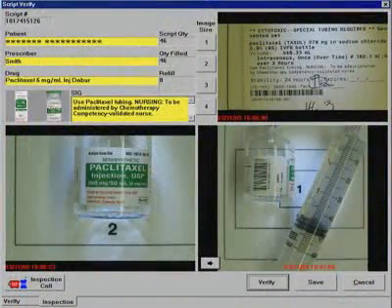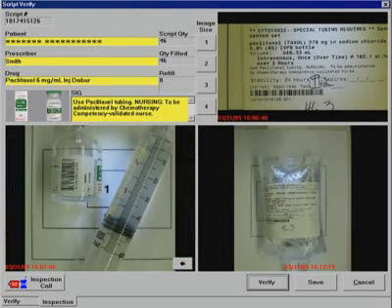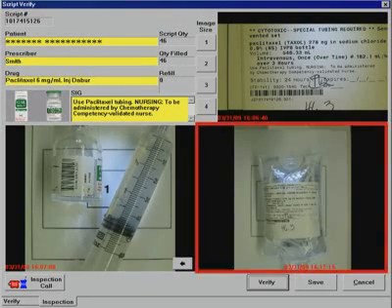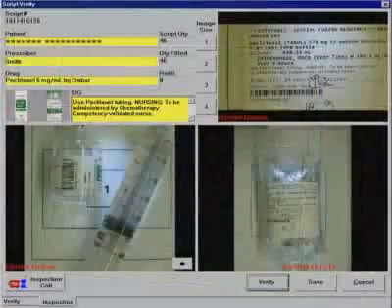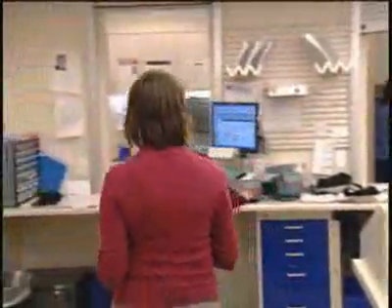If you wanted additional images, could you take additional images? Correct. If I needed to add another 2 cc's, they could add images onto this prescription, and I would know that they added that to make that the full 46.3 if that were not correct. Okay. So make that bigger. Sure. I've got the right patient again, and hit verify, and then either type in my password manually or use the barcode. They're verified and ready to go and to be checked out at the window with the nurse.